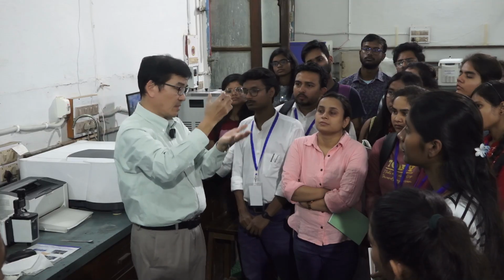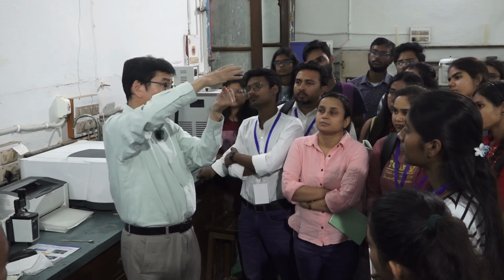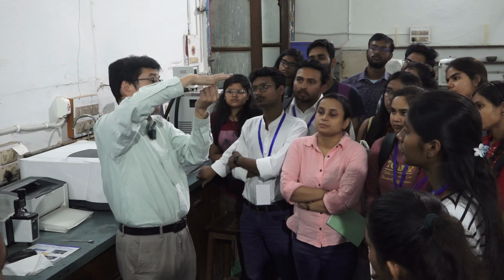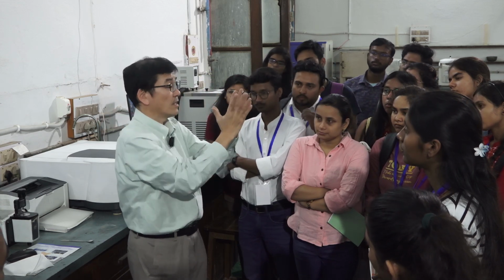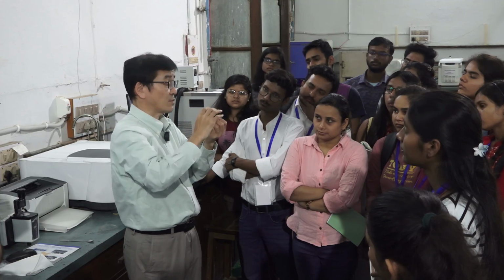Then we put the liquid sample below the prism, and this liquid sample absorbs the evanescent field of IR light. So without preparing a liquid film, we can measure the IR absorption spectrum easily.